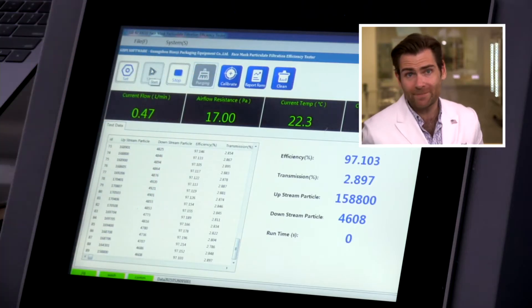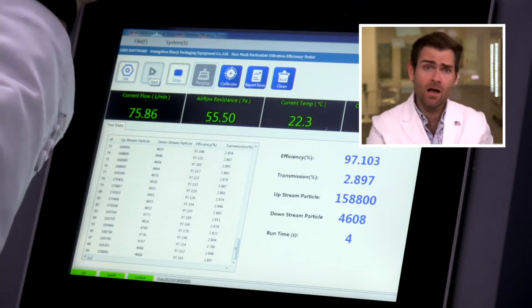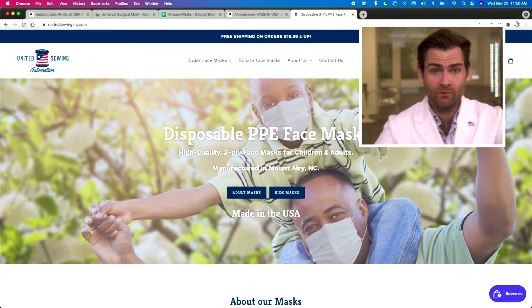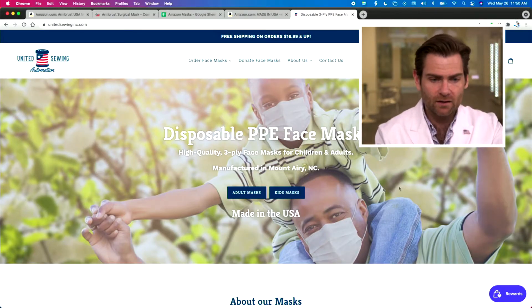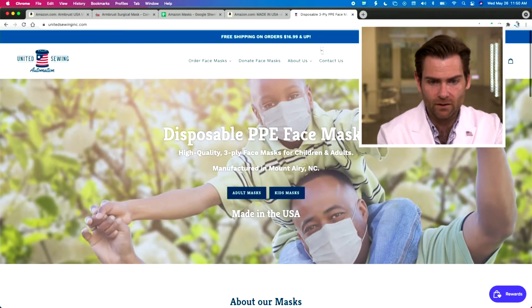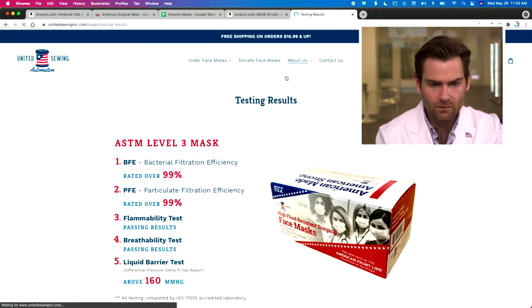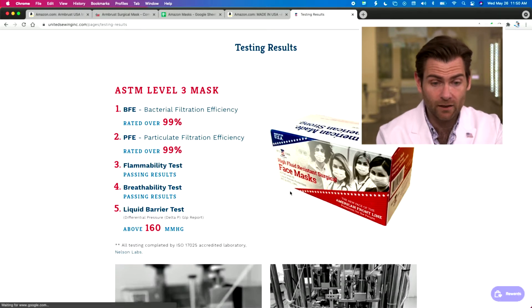Alright, we'll let it rip. This is a PFE machine — if you want to know what that is, check out the link to learn about particulate filtration efficiency testing. We're looking at the American-made, American Strong, United Sewing mask. I love the box. We bought this on Amazon but they have a really cool website. This is one of those companies that stood up in the middle of the pandemic.